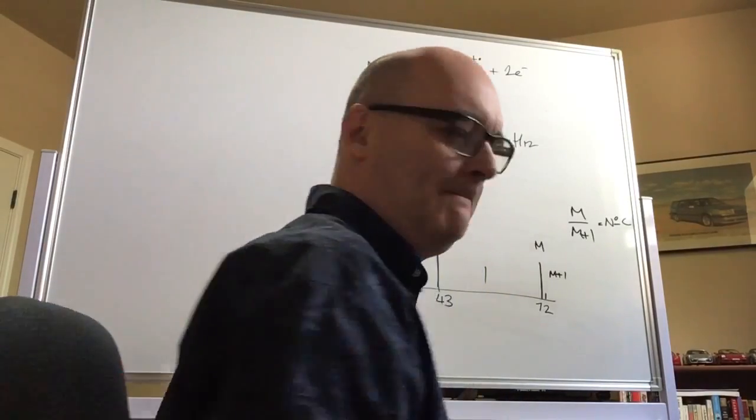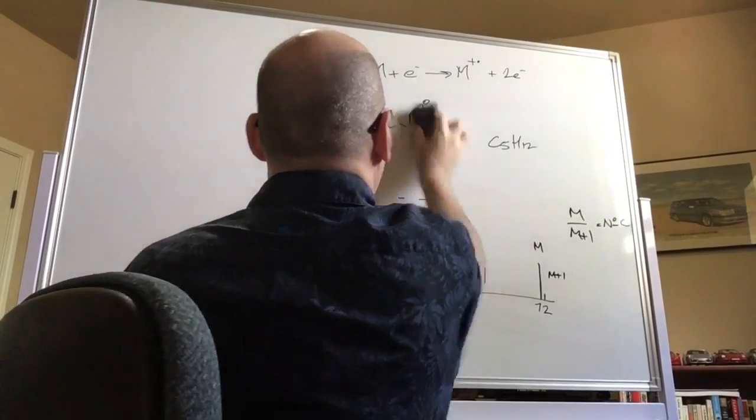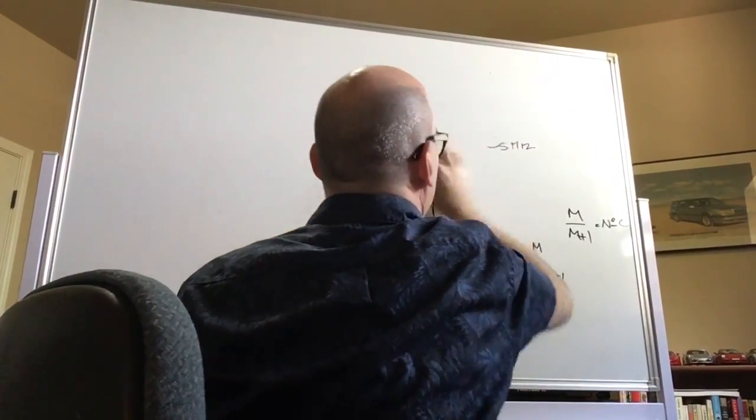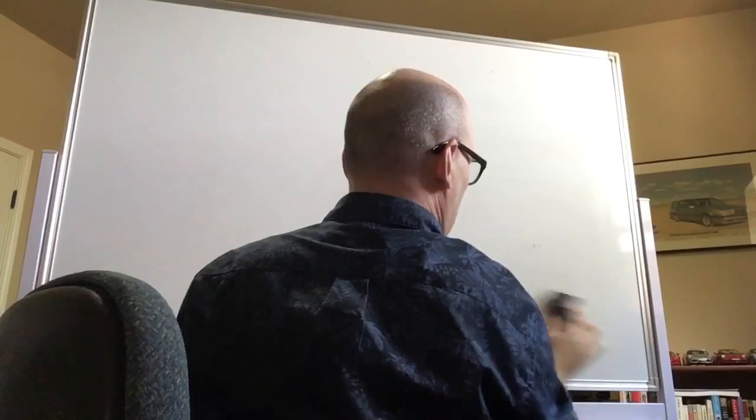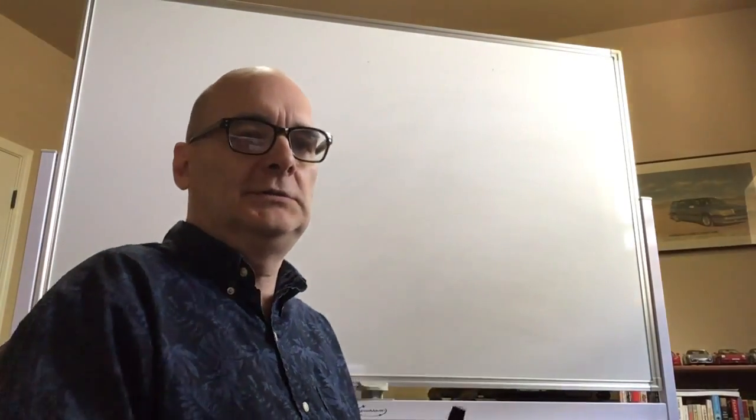All right, now fragmentation happens mostly by just simple sigma bond cleavage. One of the things that if you start to look, yeah, Alden, go ahead.